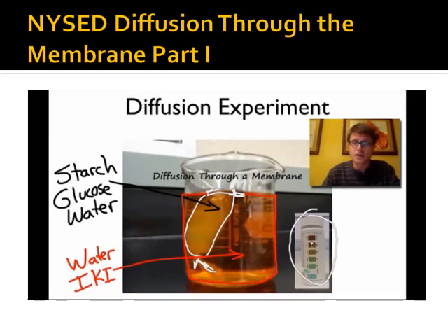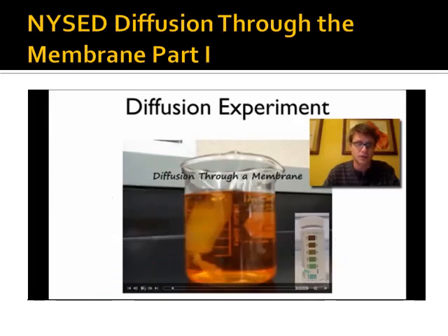And so if we were to take this glucose strip and put it inside this, are we going to find glucose? The answer is yes. So we'll have a positive in here. And I just said a second ago that there's glucose in there, so that shouldn't be a surprise. If we were to take a test strip and look out here, we're going to find no glucose. We'll have a negative for that. So there's no glucose out here to start with, but there's going to be glucose inside. And so this is what it looks like when it starts. So I'm going to have to get rid of this writing for a second, and then we'll play the video for a bit.